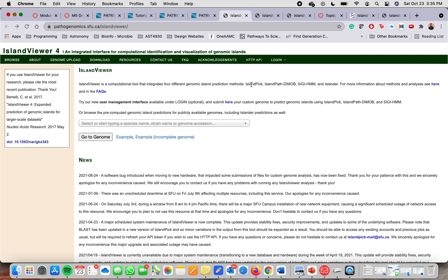It is a computational tool that integrates four different genomic island prediction methods. Here you have the name: IslandPick, IslandPath, DIMOB, SIGI-HMM, and Islander.